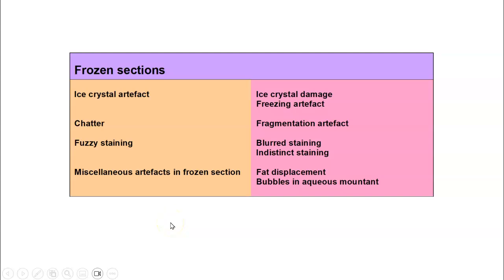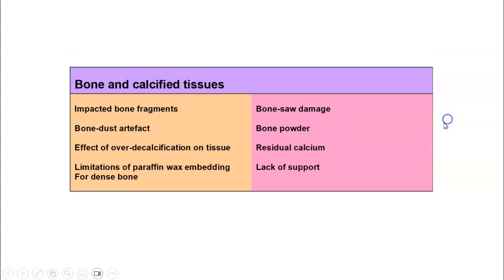Frozen sections can also give rise to artifacts, for example, ice crystal artifact. So it's very important to make sure that your forceps is dry and also the surface on which you are trimming your frozen section specimens is dry so that you don't introduce water into the specimen. And sometimes even for decalcification, for example, if there's over decalcification, this can give rise to a very hazy appearance of the specimen with loss of nuclear detail, and of course it can also impact immunohistochemical staining or molecular tests.